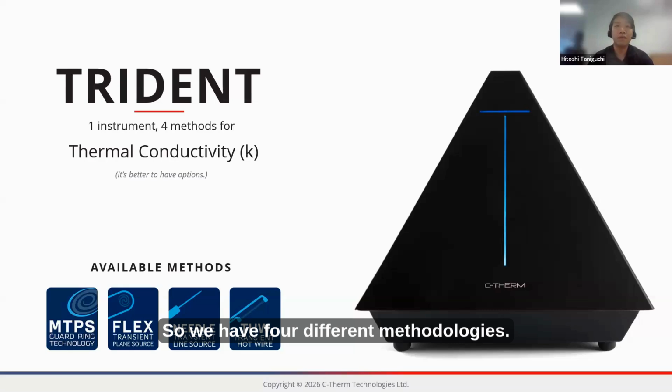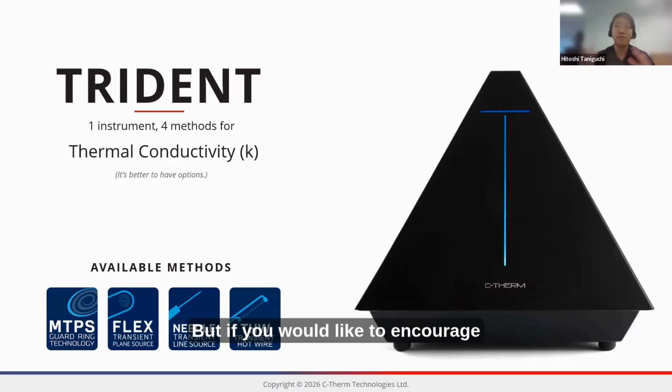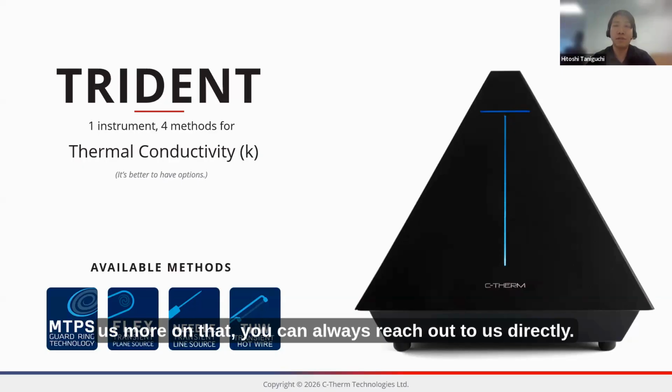So we have 4 different methodologies, each specializing in different applications and use cases. But if you would like to inquire more on that, you can always reach out to us directly. But for today's discussion, we will be more geared towards STA, the thermal analysis side of things.